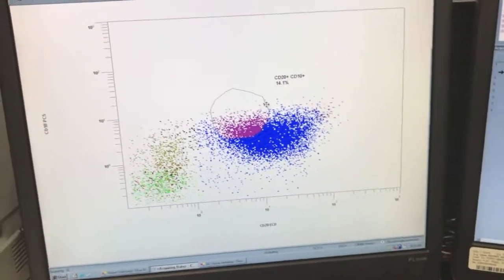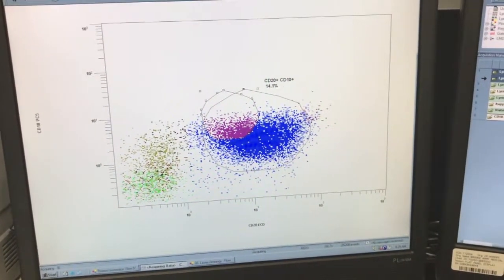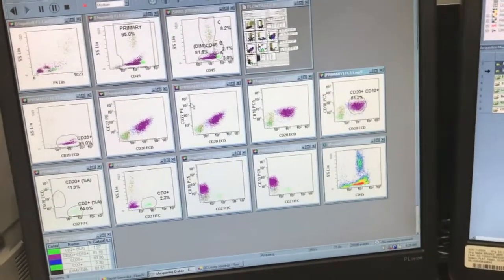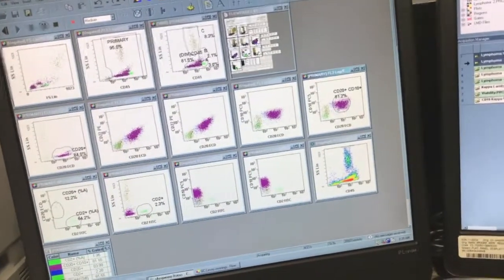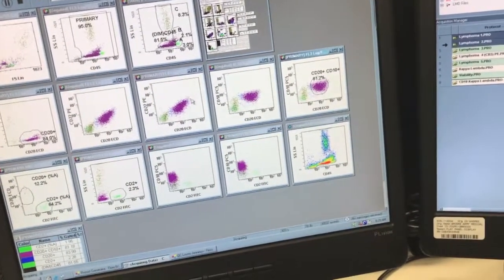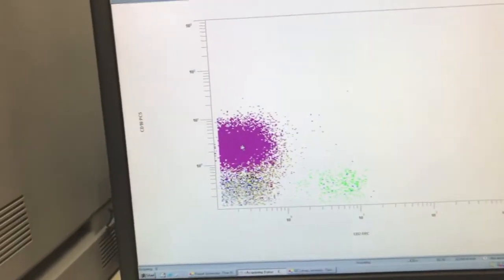Now this is a very important part, and once you see something like this, there are things that need to pop into your head. Once you see this, you should automatically assume, was a CD10 kappa lambda ordered, or was it the regular CD19 kappa lambda? Because you're going to have to run it, because these are going to have a malignant light chain possibility.